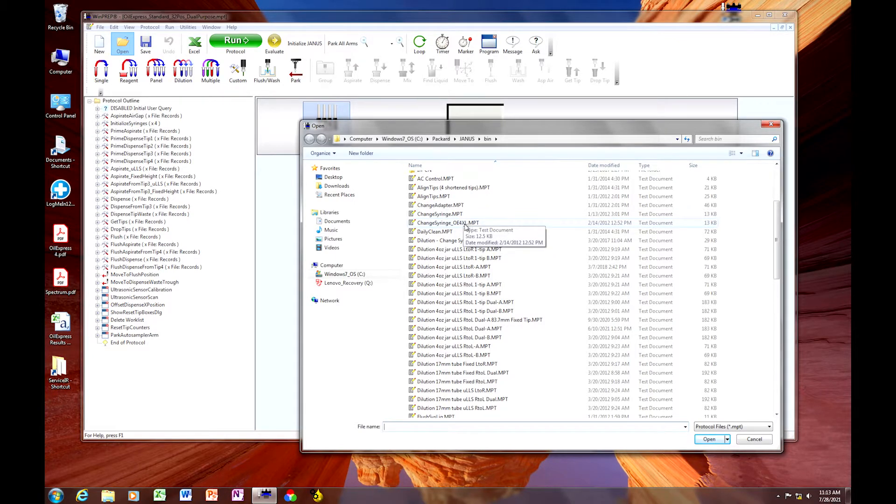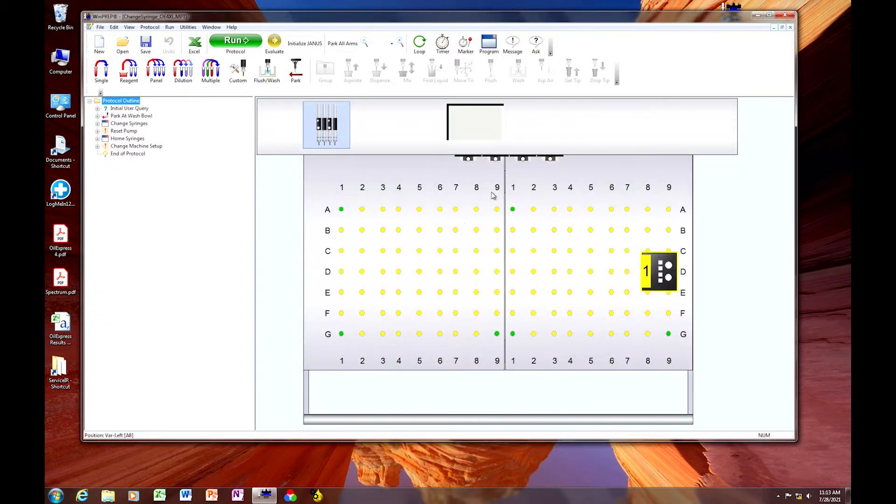There's another protocol for the short or mini deck. Make sure that your deck layout appears correct. When you start this, the VersaTips are going to move over to the dispense cup area to give access to the syringes. Make sure that there is nothing in the way and click Run.